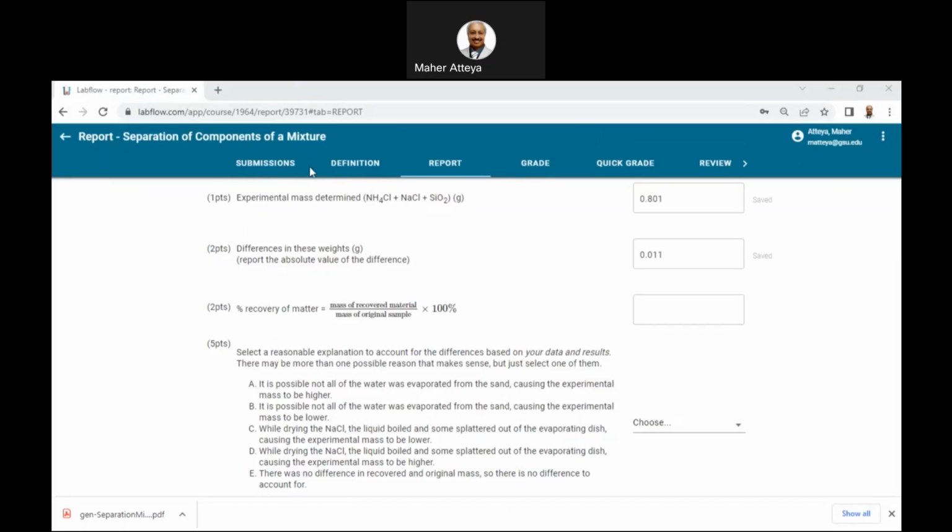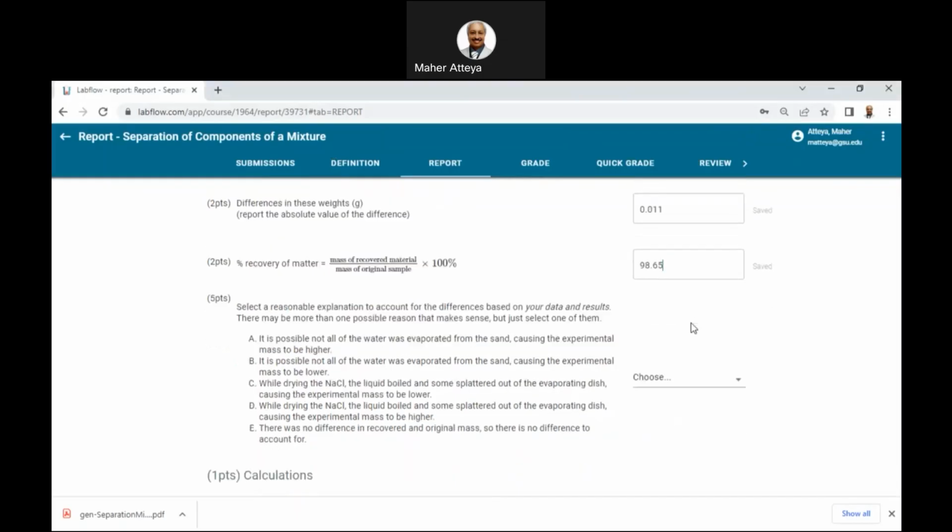Yes, okay. So it will be 98.65. Is it 65? 65, yes. So this is 98.65.